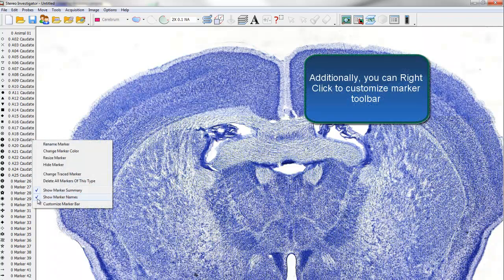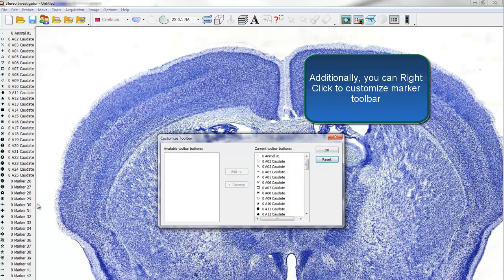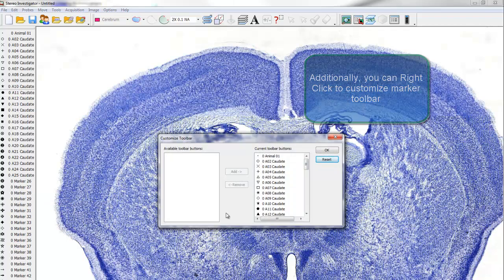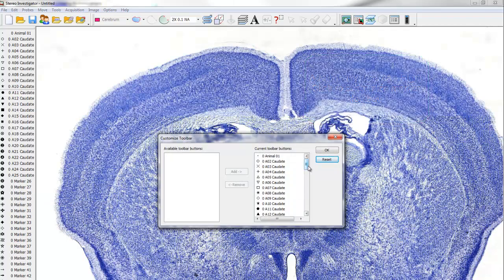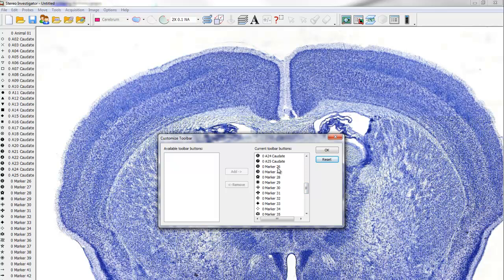Additionally, you can right-click to customize the Markers Toolbar. Remove or add markers from the list. You can click Reset to undo any changes.